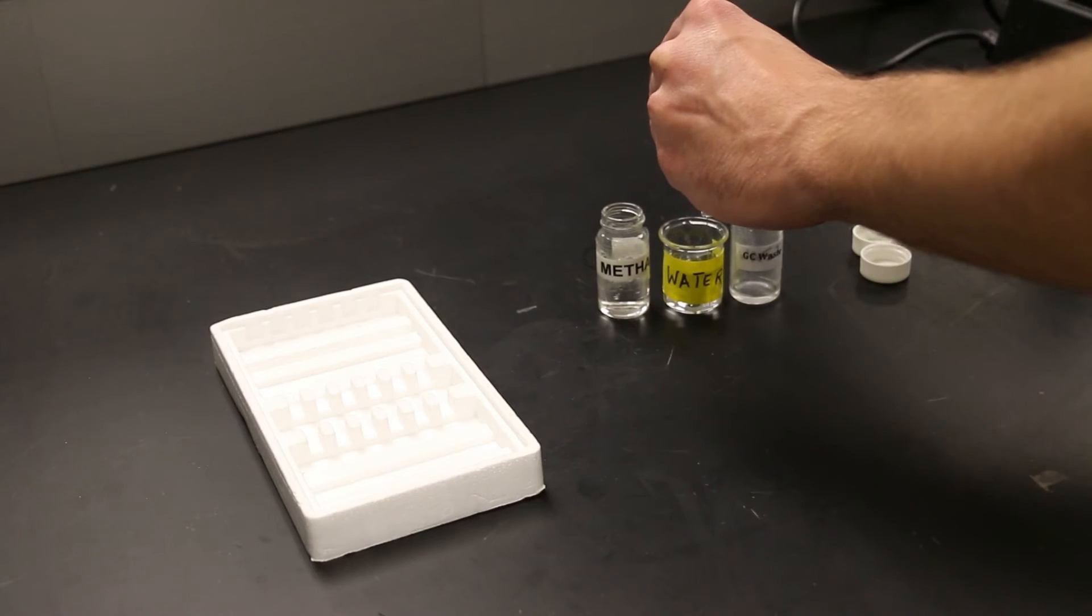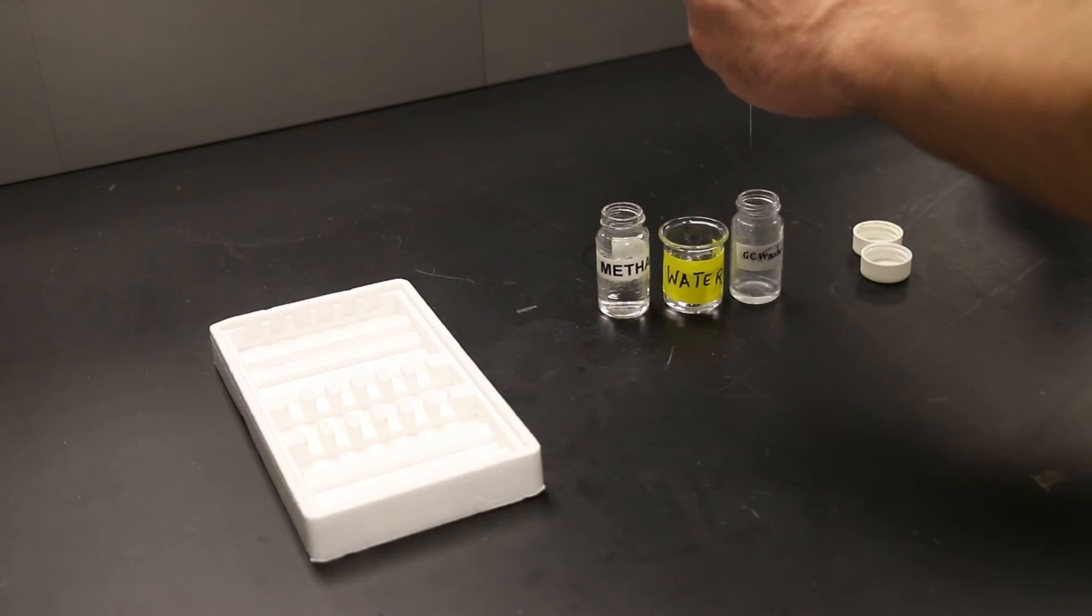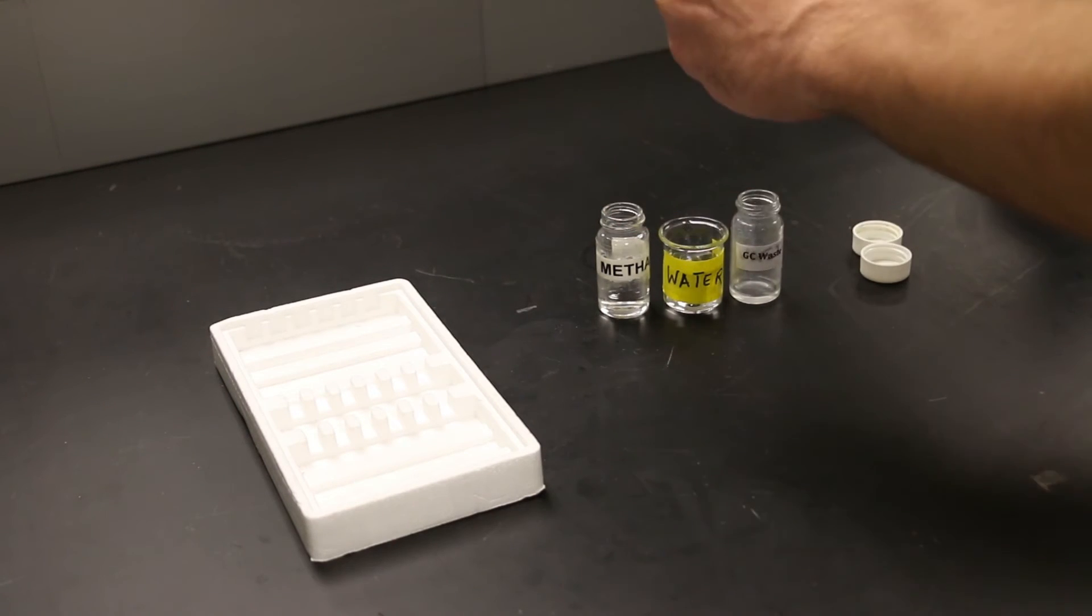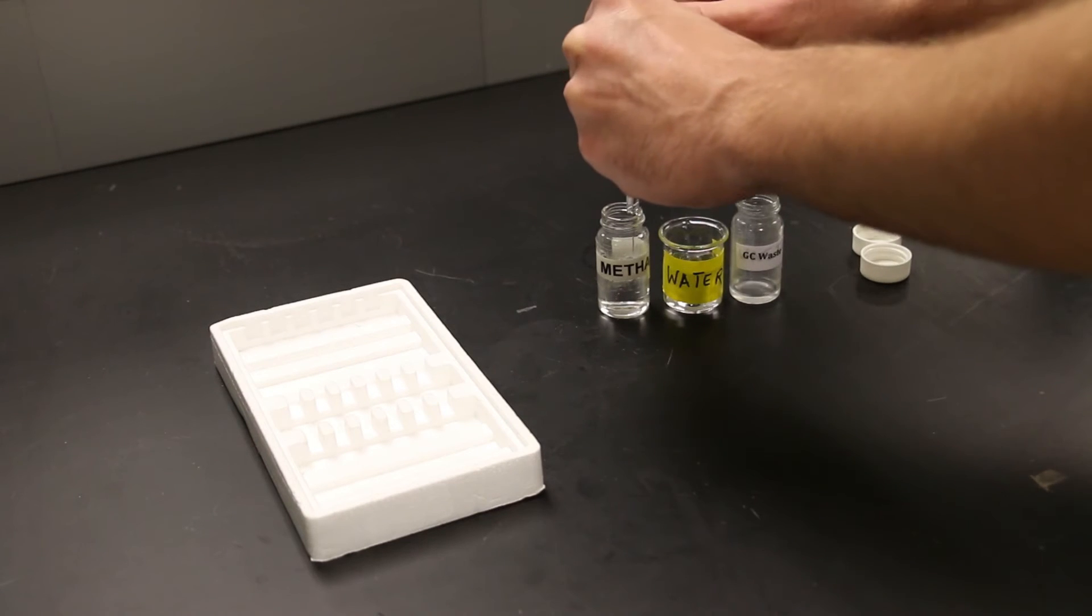Clean the syringe just like you rinse the syringe. Pull up seven to nine microliters of water, expel that rinse into the waste container, and then follow that water rinse with two rinses of methanol.